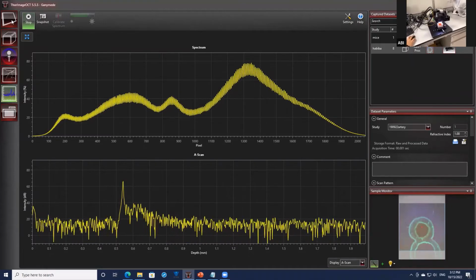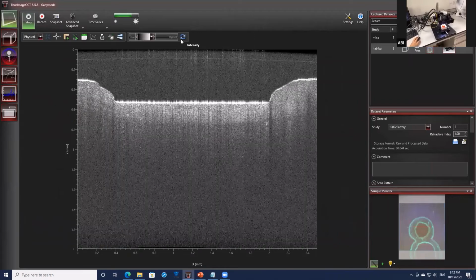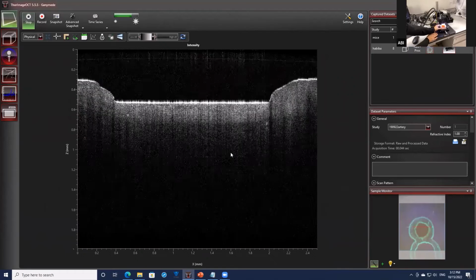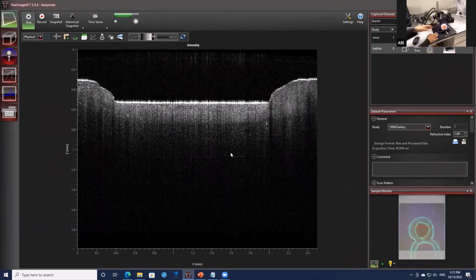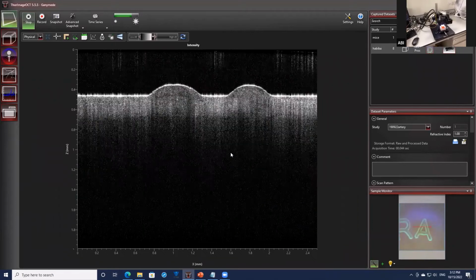And if you want to take a 2D, you can just do it here. We can check a smaller structure. Suppose this one. Here we can observe. You just imagine we're cutting it like here, and then we're seeing it on the side view.